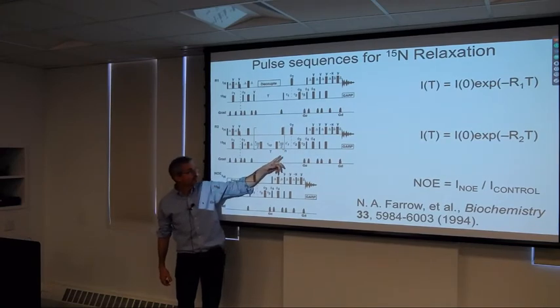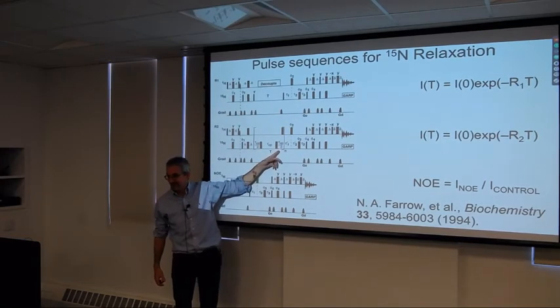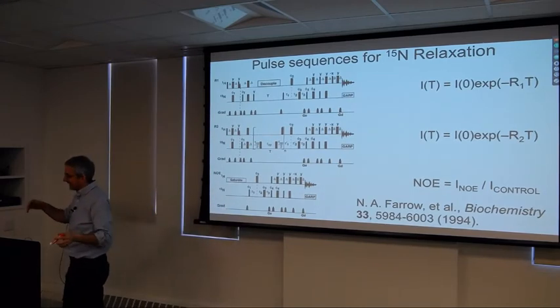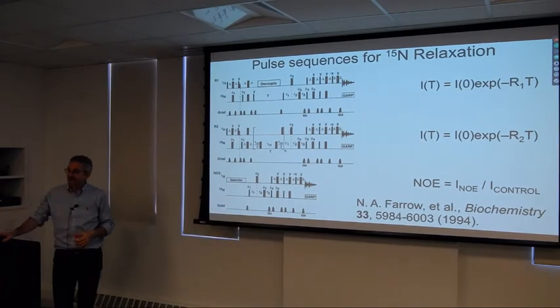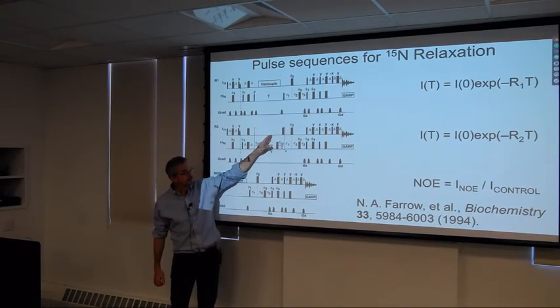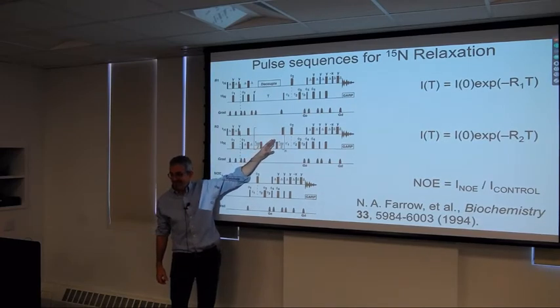It doesn't necessarily have to be every even echo. It's shown here as if it's every even echo. That's not the case. Again, it's okay if they're spaced by, say, 11 milliseconds, 1/J-ish kinds of times, but they have to be on even echoes. Otherwise, if they're on this echo, you don't get the compensation against pulse imperfections, and there's a faster decay of magnetization.